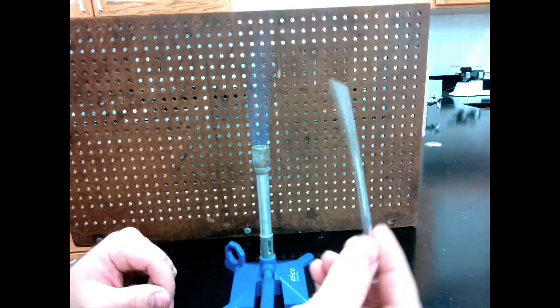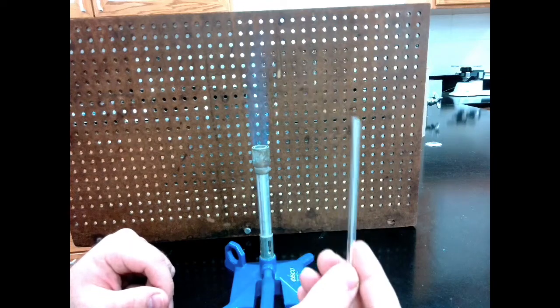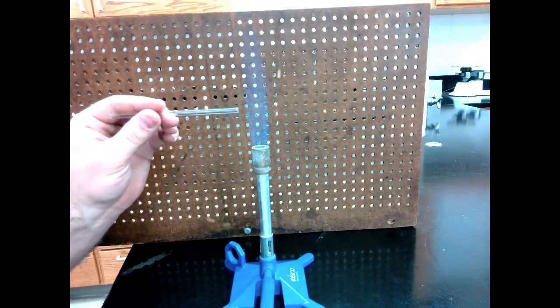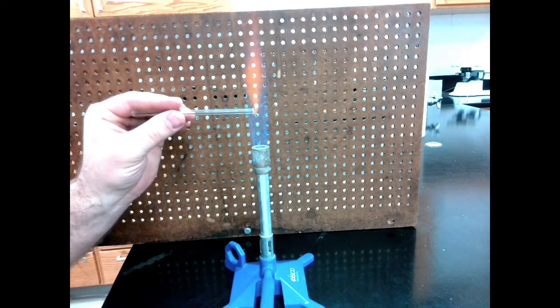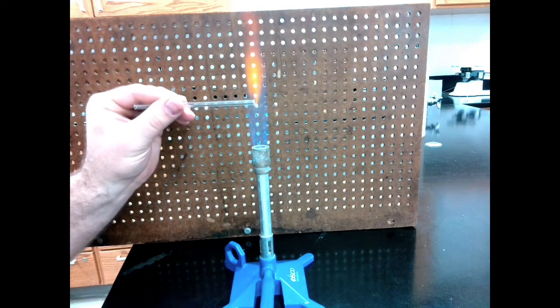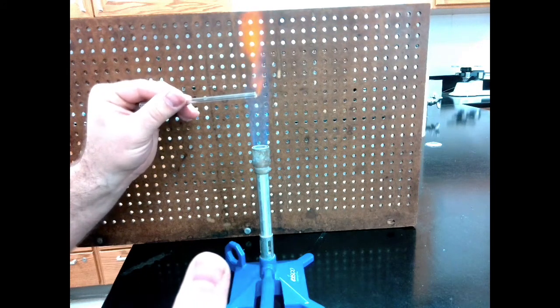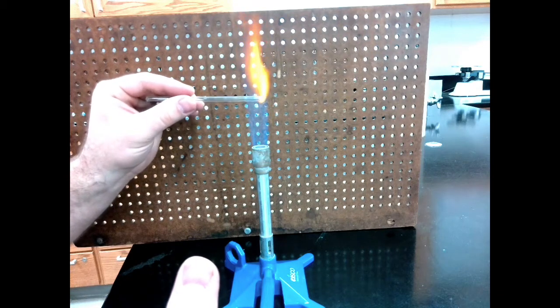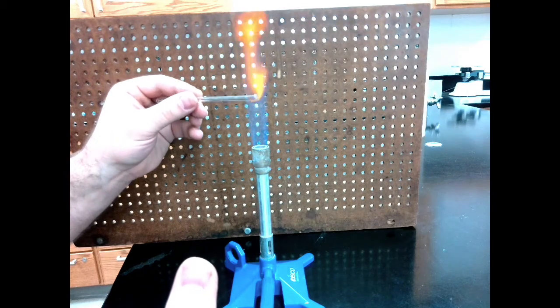And so when I am melting glass in order to smooth it out, I'm going to be putting the glass tube in that part of the flame. So I'm just going to bring it in until I get to that point, and I'm going to be moving it back and forth, just rotating it back and forth. The flame will start to turn orange when the glass starts to melt. And I'm going to be able to see the glass visibly change. If I'm looking at it, I'll be able to see those rough edges start to smooth out.